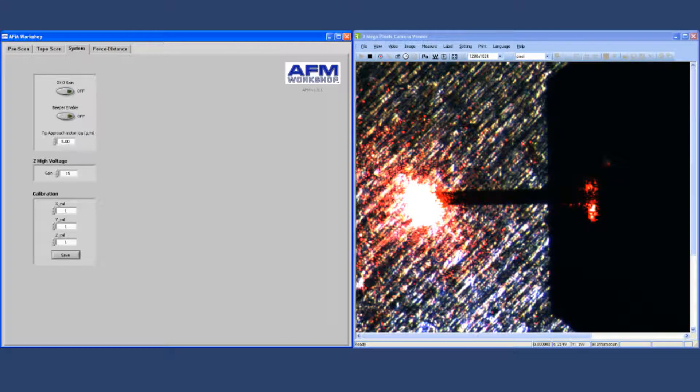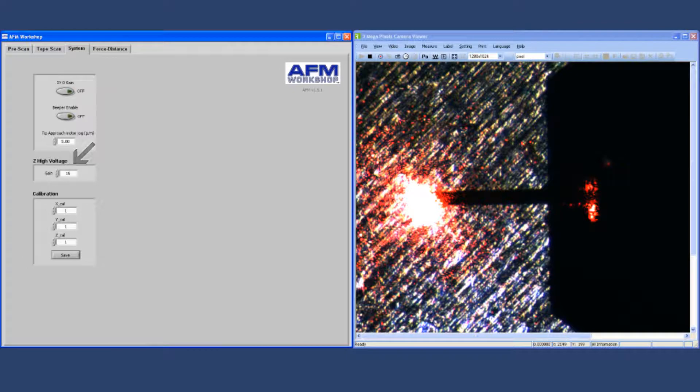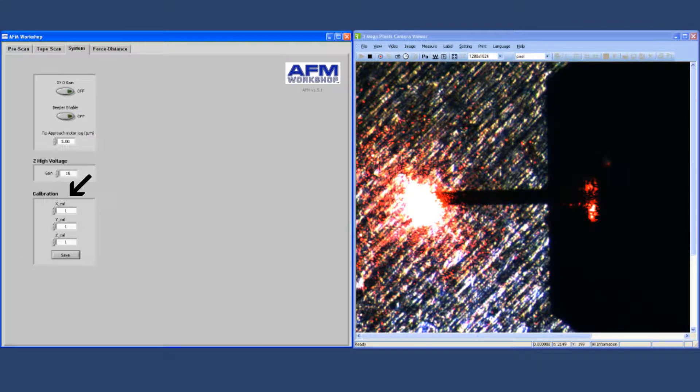You can change the Z high voltage gain to get better noise performance in the system. And finally, the calibration settings for the particular scanner that you're using.